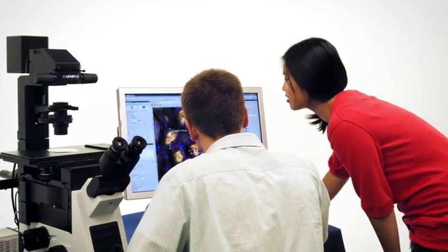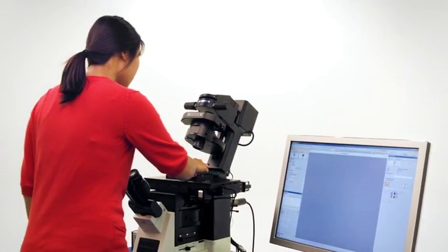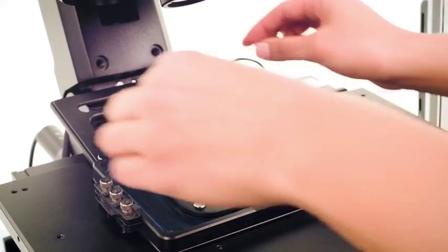The IX-73 Smart Microscope is a cost-effective tool built with the user experience in mind.